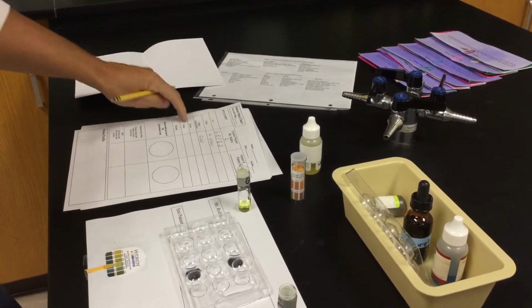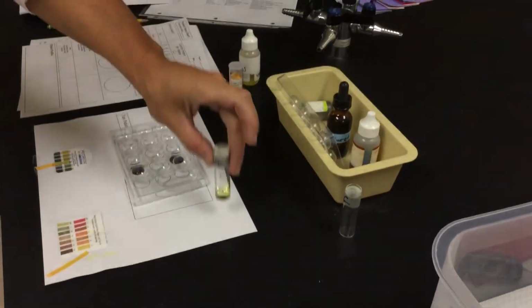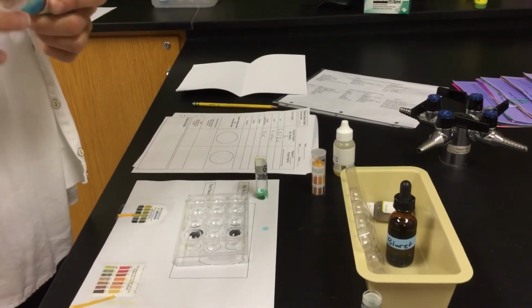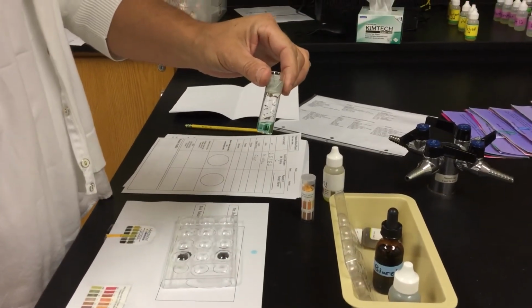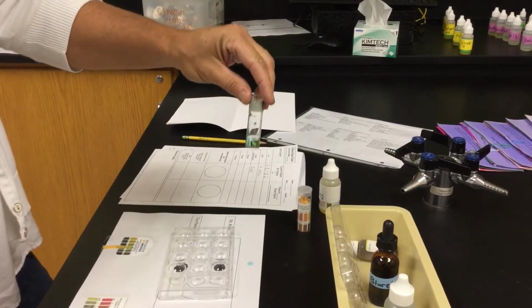Next we have glucose, proteins, and chlorides, and it goes through your instructions on how to do this within that lab packet. I'm going to go through it off the top of my head here. So to this particular sample, this glass tube that is labeled, we are going to add 5 drops of Benedict's solution. Benedict's solution, once again, is that really pretty oceany blue color. And this will actually react when activated with heat and will turn either a green color if we have a little bit of sugar, or a bright orange red color if we have a ton of sugar.